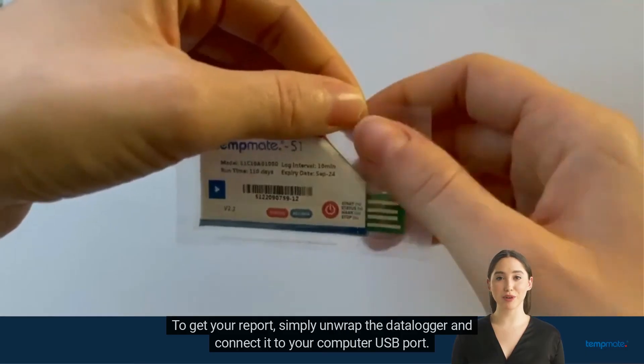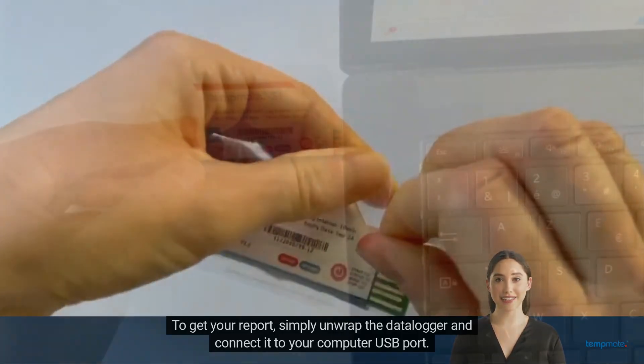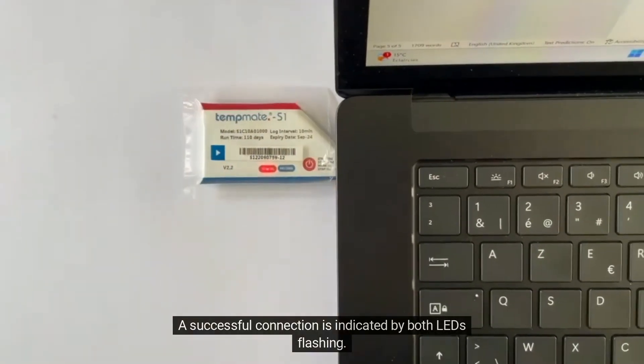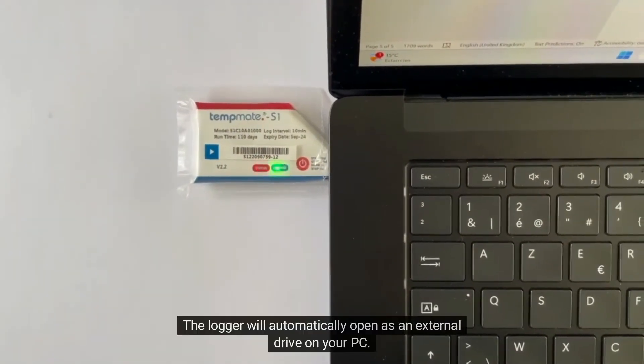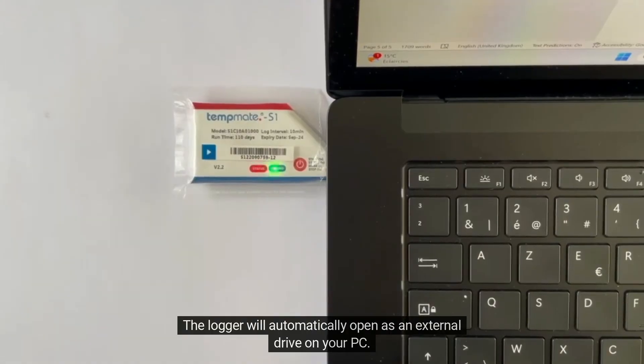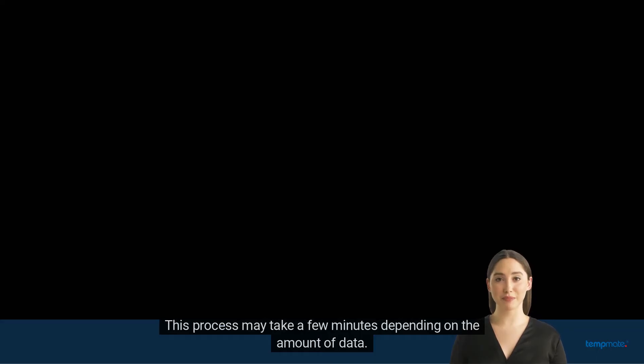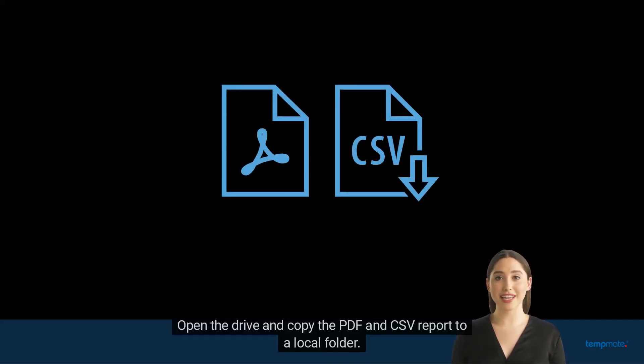To get your report, simply unwrap the data logger and connect it to your computer USB port. A successful connection is indicated by both LEDs flashing. The logger will automatically open as an external drive on your PC. This process may take a few minutes depending on the amount of data. Open the drive and copy the PDF and CSV report to a local folder.